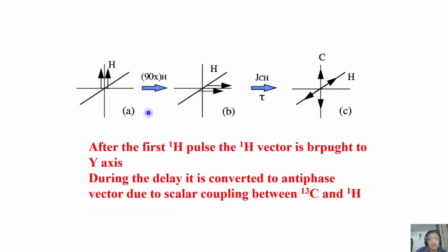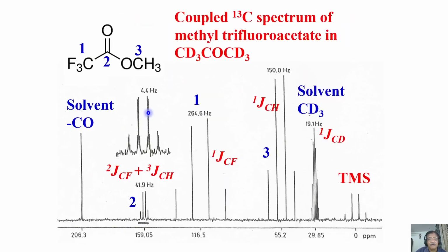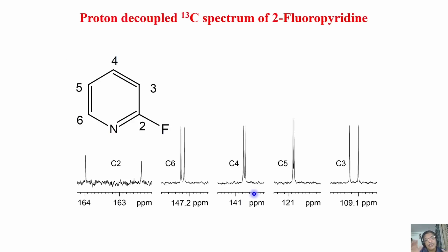Unlike in the previous example here, where we have to go by the coupling, we get a fully coupled spectrum, we can make the assignment. But again, that complicates the situation. So we have to think of an option, a possibility, where we must get a decoupled spectrum.